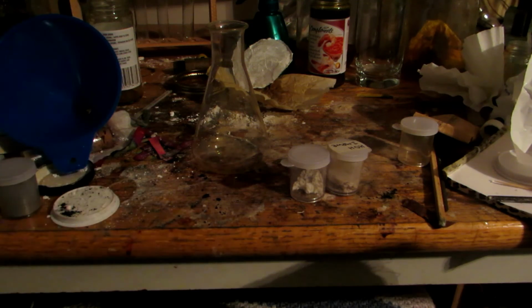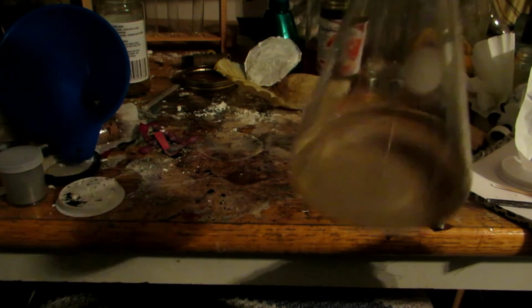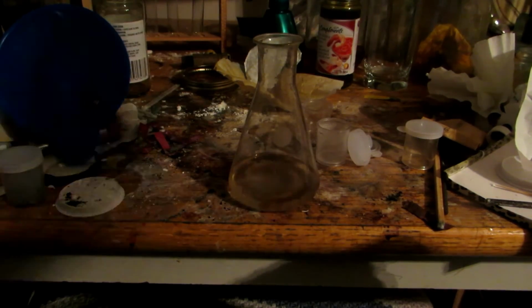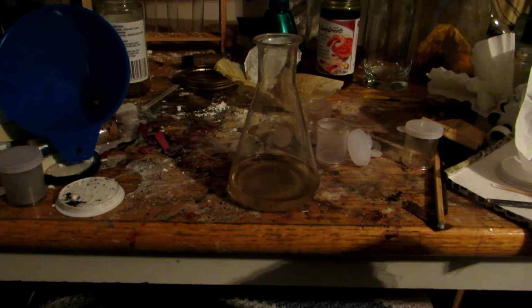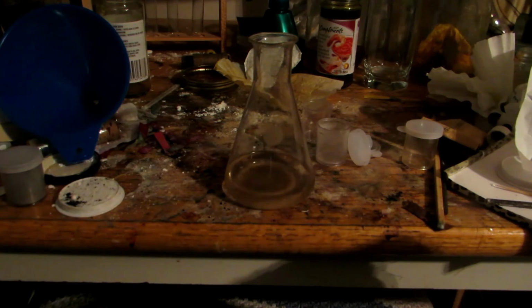So measure out some ethanol, and place in both of these potassium hydroxide samples. Okay, so as you can see, we now have a solution that's relatively clear with a bit of gray gunk at the bottom. That's most likely impurities and potassium carbonate, as it's not soluble in ethanol. But most of it did dissolve, and that's all the potassium hydroxide, which is now dissolved in this ethanol. It is important to use high purity 95 or 100% ethanol, just because potassium carbonate is very soluble in water. And if there is too much water present, we're going to get a lot of potassium carbonate contamination.